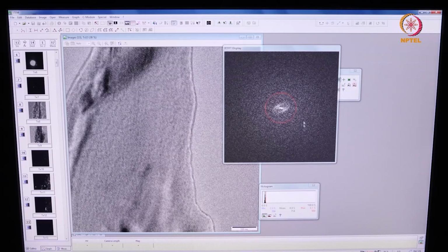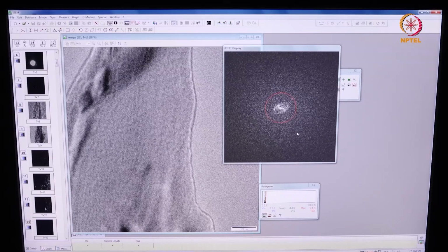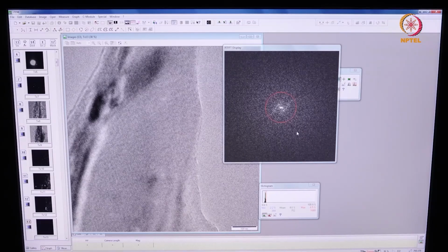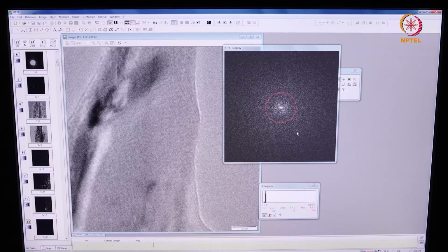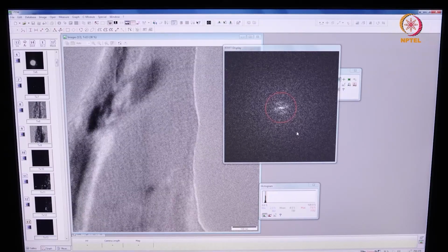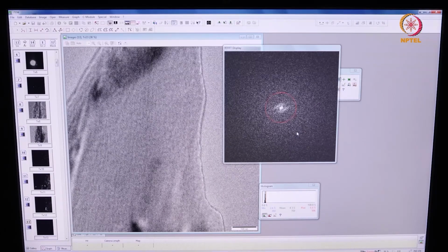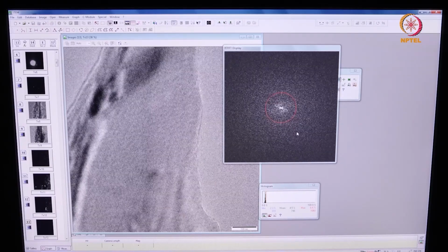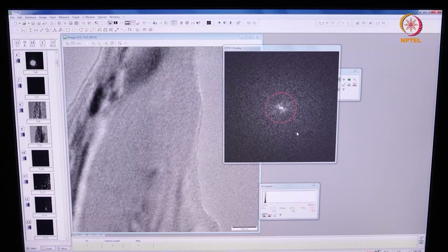So I see some kind of an ellipse in this direction. It has to be made circular. I'm not sure if it is very evident in the video recording here, but what you can see is from the edge of the sample, when I go either over focus or under focus, it appears more or less that the movement is in one plane. So this is an indication where the objective stigmatism is more or less corrected.